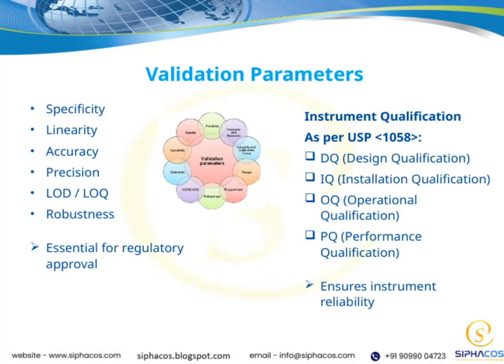Let's talk about instrument qualification, which is a critical part of ensuring our laboratory instruments meet the necessary standards. According to USP 1058, there are 4 key stages we need to focus on: design qualification, installation qualification, operational qualification, and performance qualification.